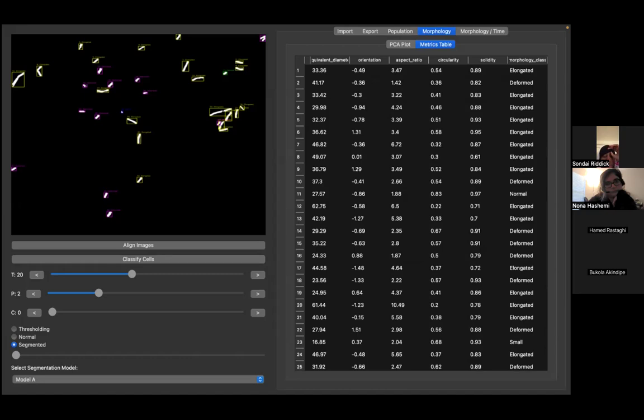The idea is when you click on the cell point, it highlights on the image, or you can click any one of the rows here, and it highlights it as well. So basically it's just for interaction, and then you can visualize better what each cell classifies.